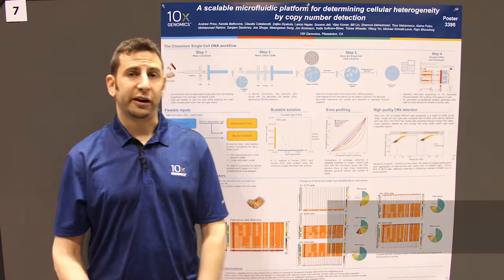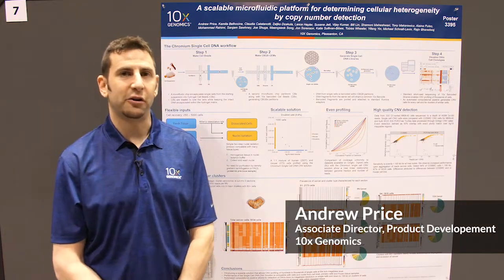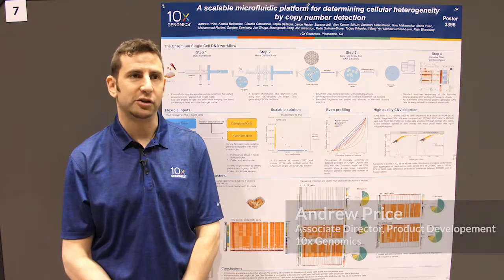Hello, I'm Andrew Price from 10x Genomics, and I'm here today to talk about a scalable solution we have for calling copy number variations on individual cells.